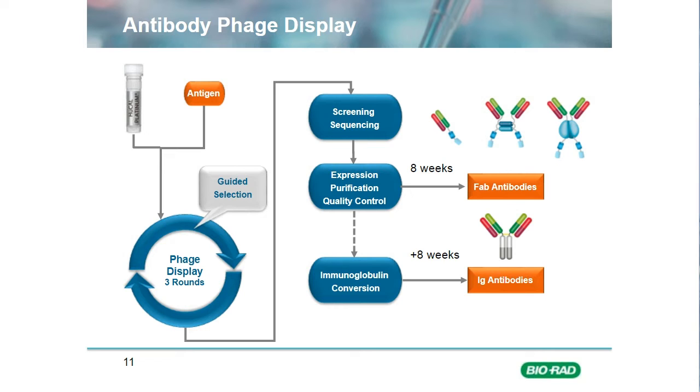And what you should then do is arrive at a final pool which is highly enriched for antigen-specific antibodies, and these can be isolated and further characterized. The second stage is during the screening, where these isolated individual clones are further characterized, and those that meet the customer's success criteria ultimately become the deliverables of the project. In the next couple of slides, I want to focus on the first area, really how the conditions under which biopanning takes place can be manipulated in order to meet the specificity requirements.